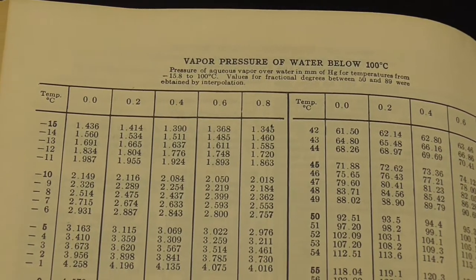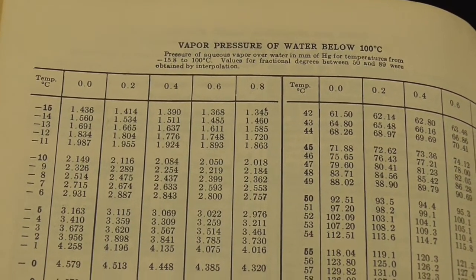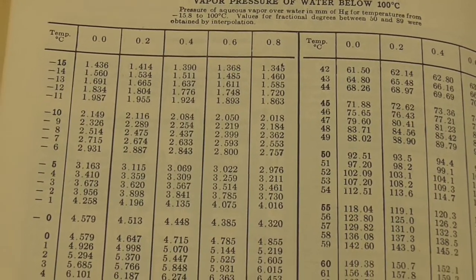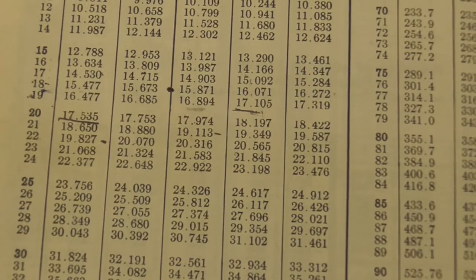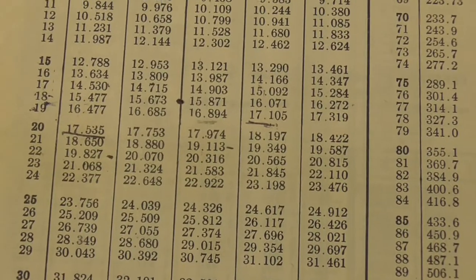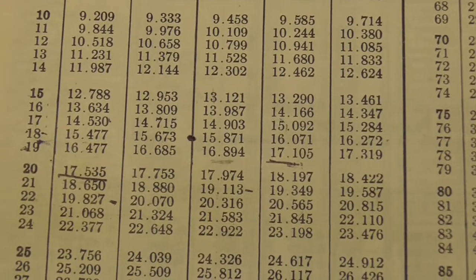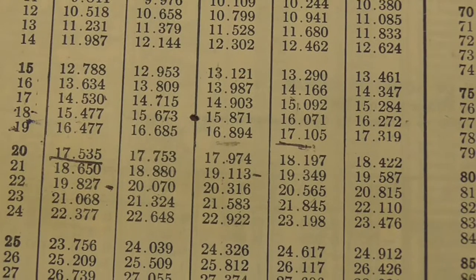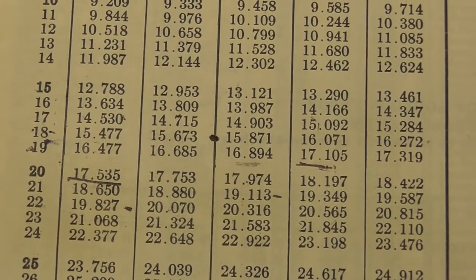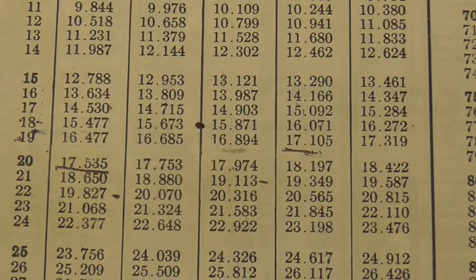So this can read to the first decimal place on the temperature. Now Dr. Dene is going to go down to the appropriate section where we were with the temperature that you just saw in the video. And so now what you should do is make the appropriate reading off of those columns with the temperature that you saw in the video.